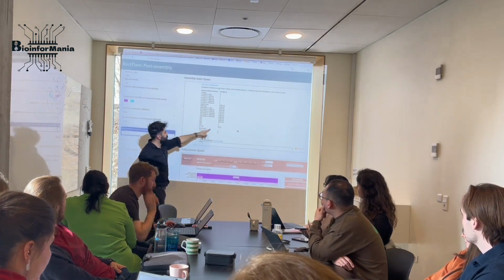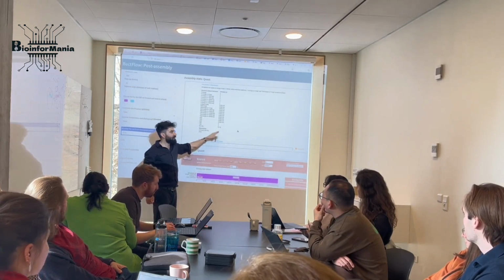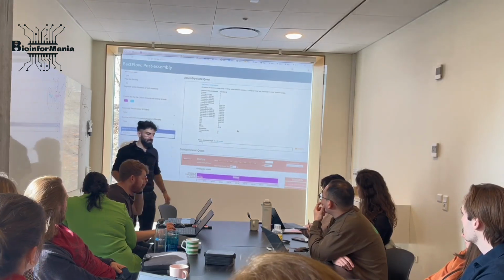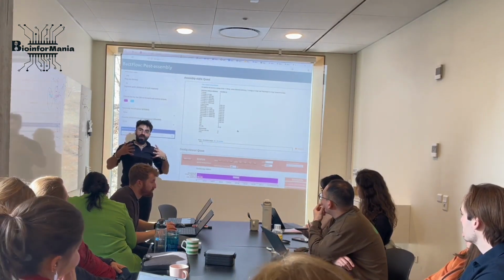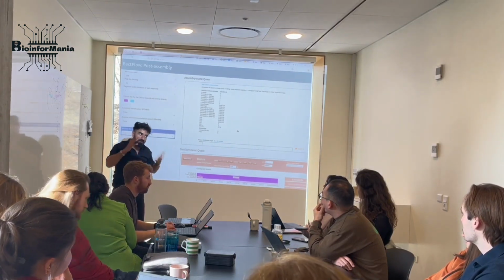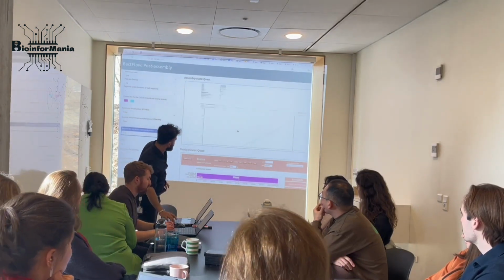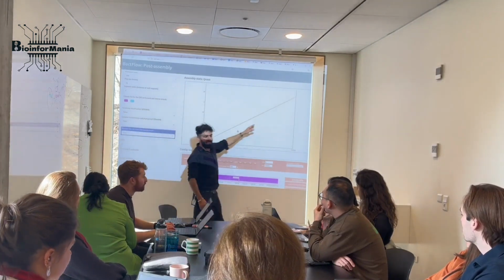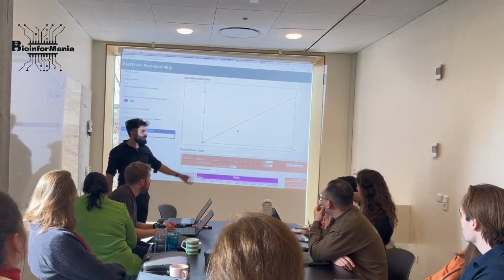It's also telling you the GC content, and it was super difficult to assemble this guy. GC content is quite high, okay? And they are very heat stable. Why? Because GC bond is hydrogen bond, and usually thermophilic bacteria have higher GC content. For example, back then I said GC content is important. All right? This one is also telling you the contiguity. The more linear up, the more contiguous it is. Okay, this is the plot.